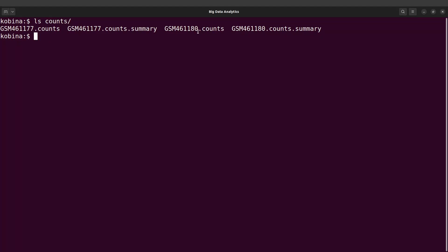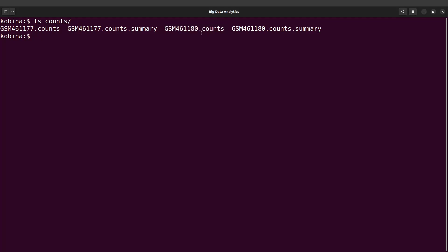Now let me mention that the outputs — the counts we have — include both the summary and the main counts files. You can visualize these using spreadsheet software, which I will show you how to do. But first, let's look at a summary for sample 461180. I'll do a head command on it.